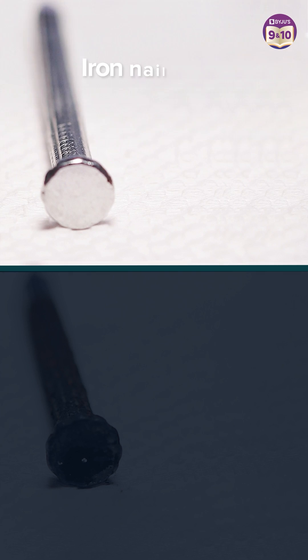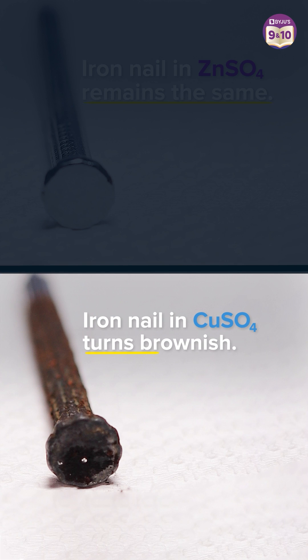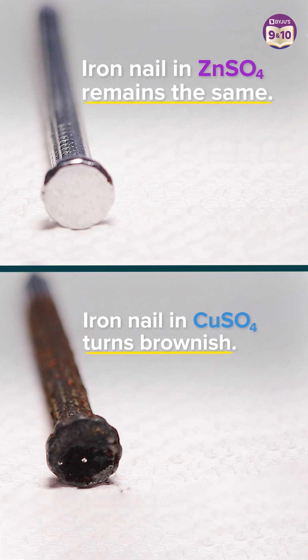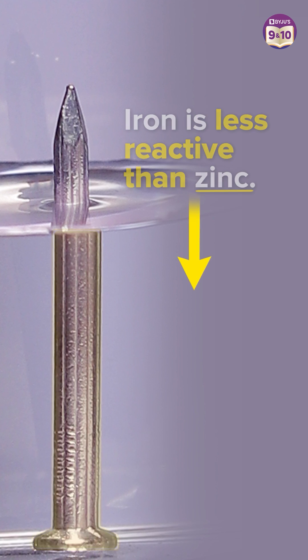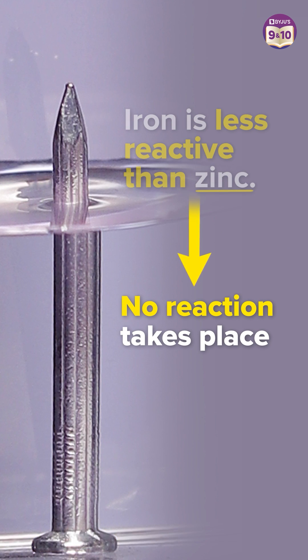The iron nail left in zinc sulphate solution remained the same. But look, the one in copper sulphate solution turned brownish. This happens because iron is less reactive than zinc. Therefore, no reaction takes place.